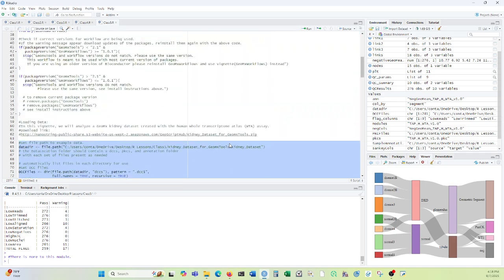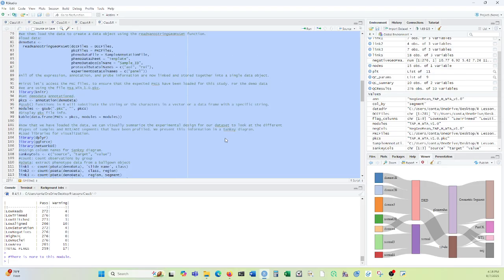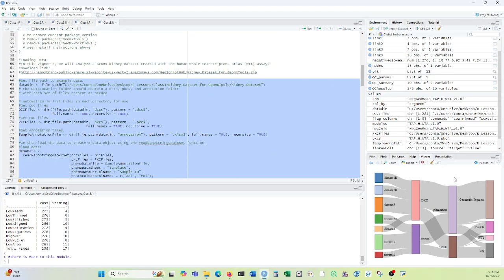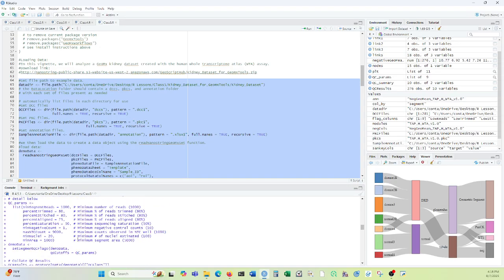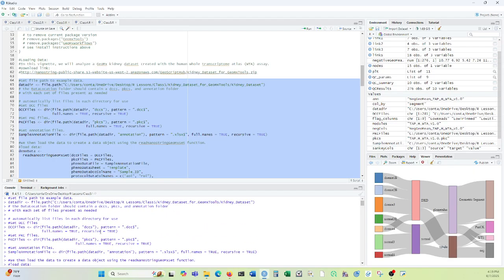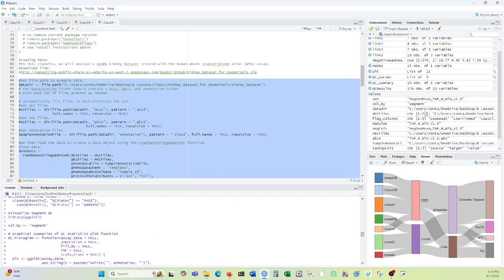All right. Sorry, this took a moment because it was working with a lot of data. But you can see here, I didn't have to click through everything individually. But suddenly we have all these beautiful figures. I'm showing this one. And these various tables right here. So you can just run this and then get all the pieces of data you actually need off of it.